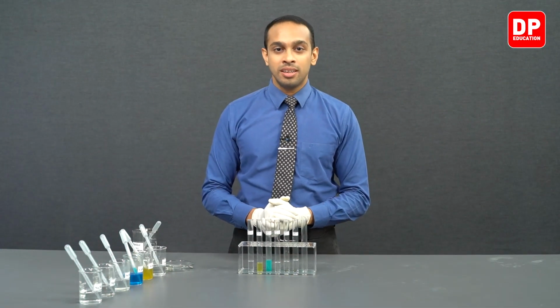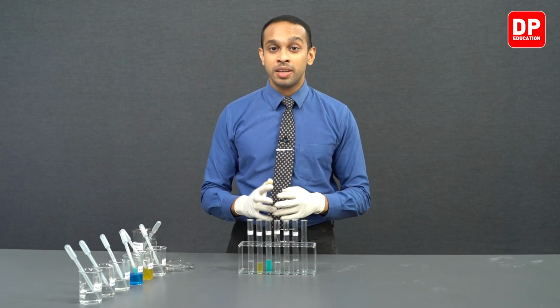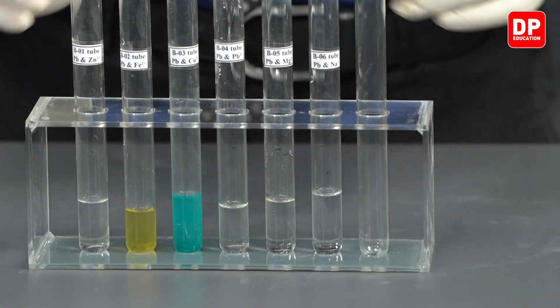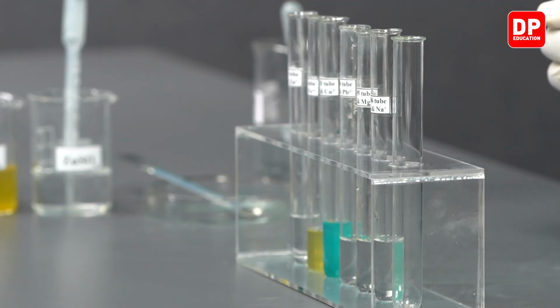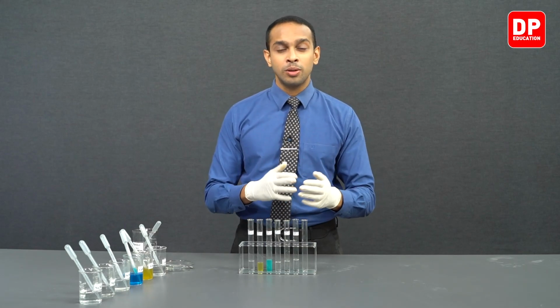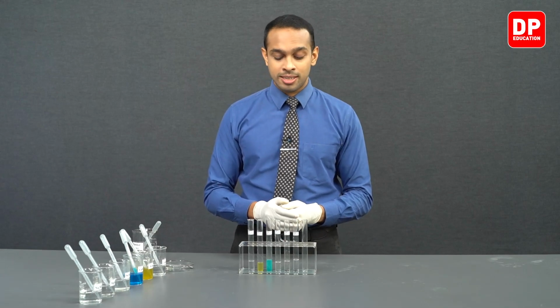Now students, let's observe what has happened to our solutions after we allowed the reaction to take place for about 10 to 15 minutes. So you can see over here all of the solutions except for one solution has not shown any reaction. So let's first take a look at the solutions that have not shown us any reactions.